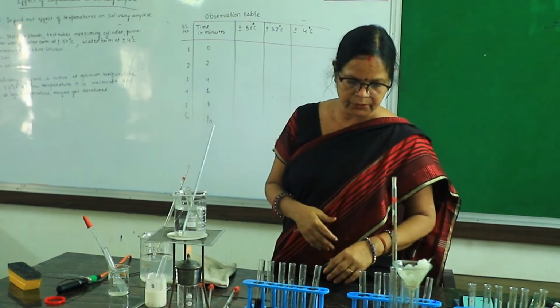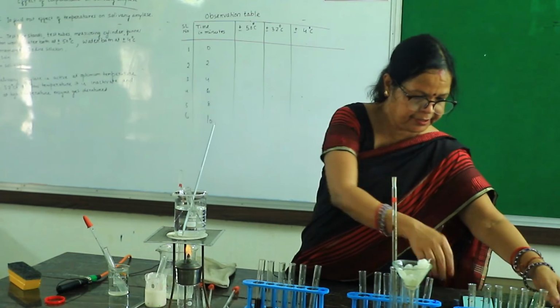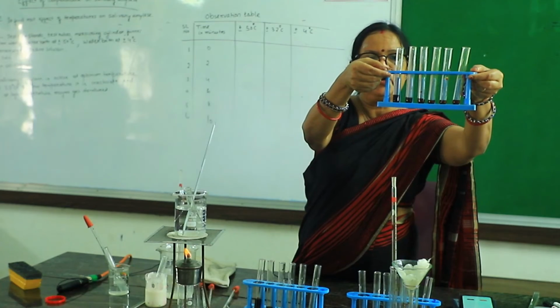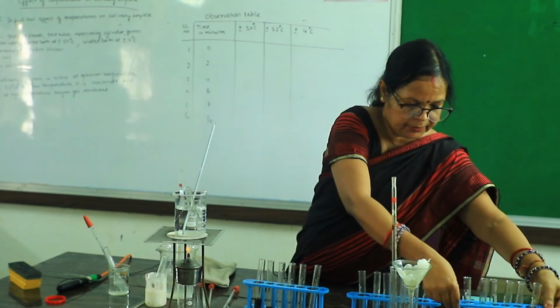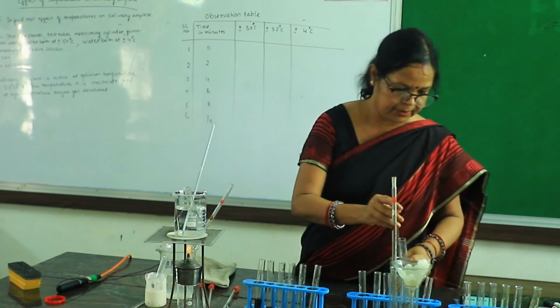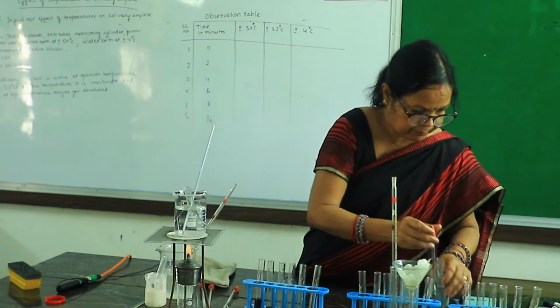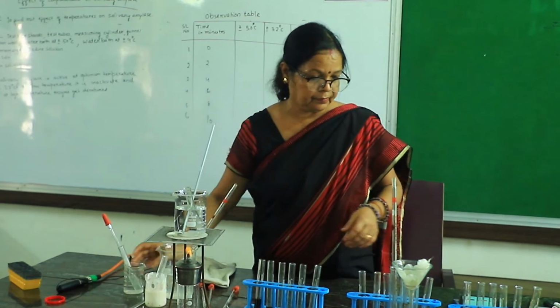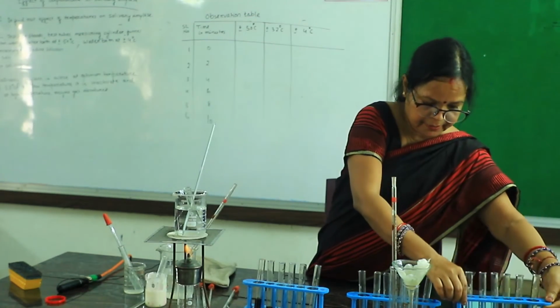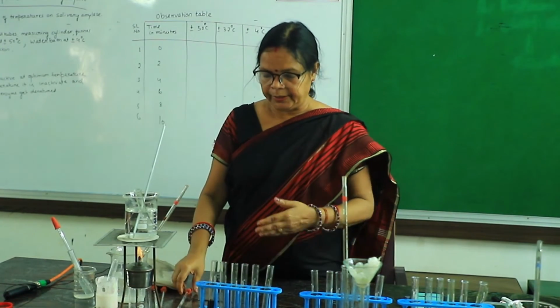Here also all three test tubes turned blue black. And here there is a change. At 0 minute it is blue black, at 2 minutes it is blue black, and for the third one, okay, it is iodine color. Stop.